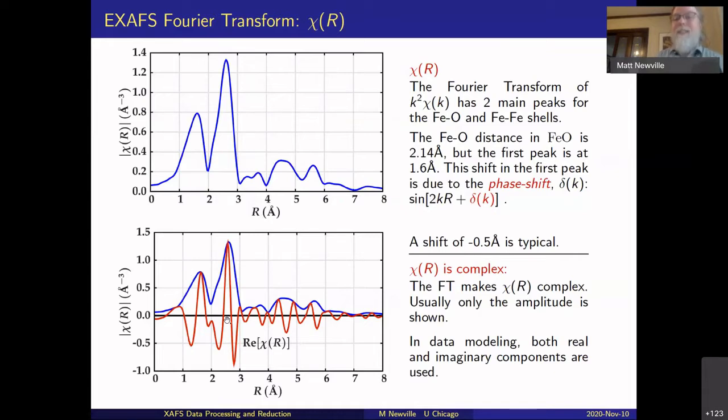So we need to consider not just the amplitude, which is typically plotted and what you'll see almost exclusively in the literature. Actually, there are oscillations, and we're going to fit oscillations. We're going to make sure we really calculate that and work with the data correctly, because these oscillations and the phase of that curve are important, and we'll use it for the modeling. Both real and imaginary. I usually show one or the other, and I go back and forth on which one I show, so it doesn't matter.